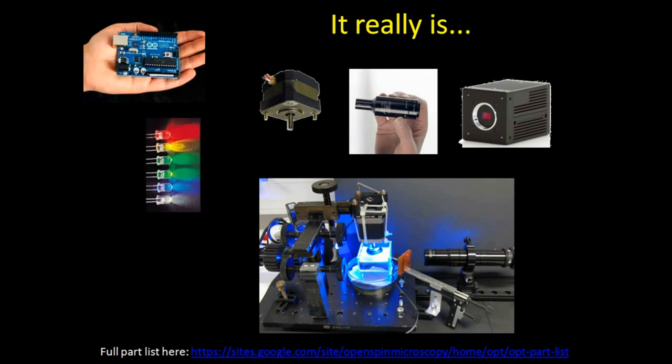The other thing you have here is basically an LED light, blue light, that shines through the sample and generates fluorescence. So if on a conventional X-ray system you have light shining through the sample and casting a shadow of the internal organs, captured here by the camera, in this case we can actually operate this system using fluorescence, which is very dear to us biologists.